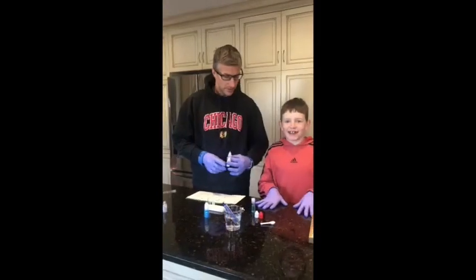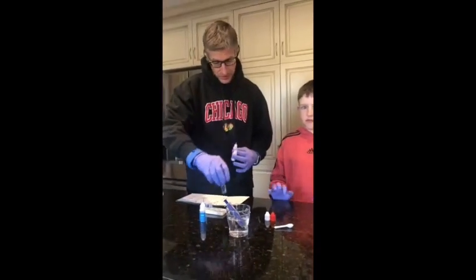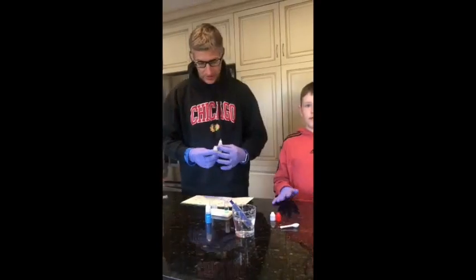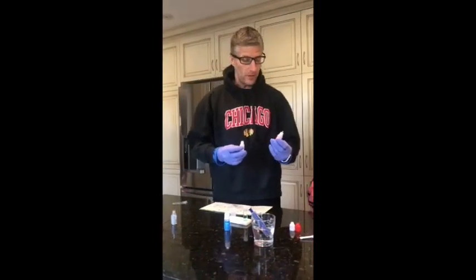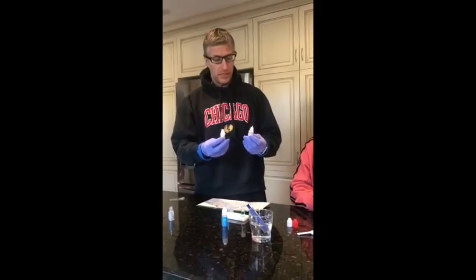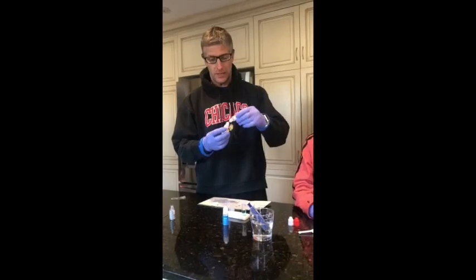And we're back. So Duncan just completed shaking the copper solution up for us. So that's done. Thank you, Duncan. Next thing we're working on right now, sorry, a little bit of a hiccup. I had to open up the vial as we're pouring the sodium hydrogen sulfate into the tin chloride. So we're going to do that now.